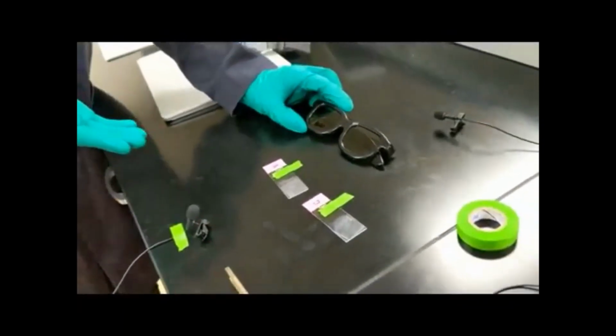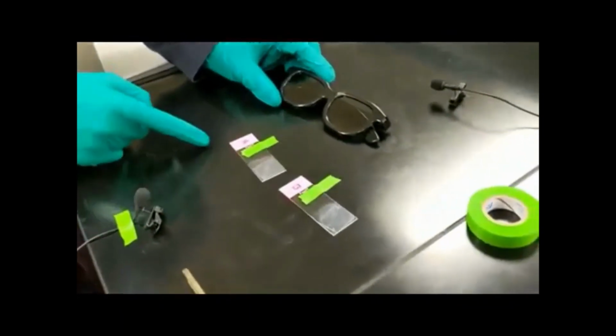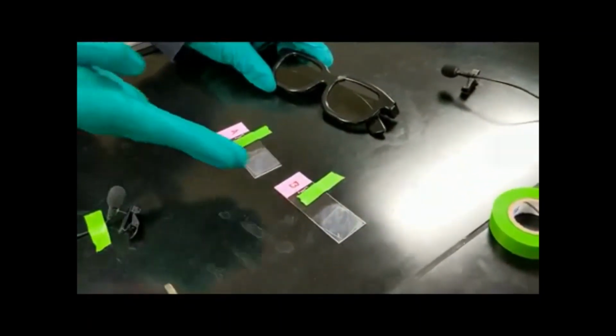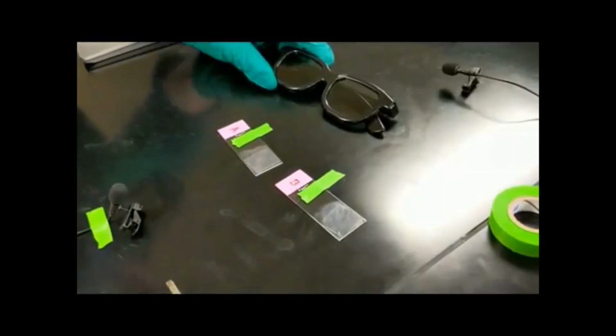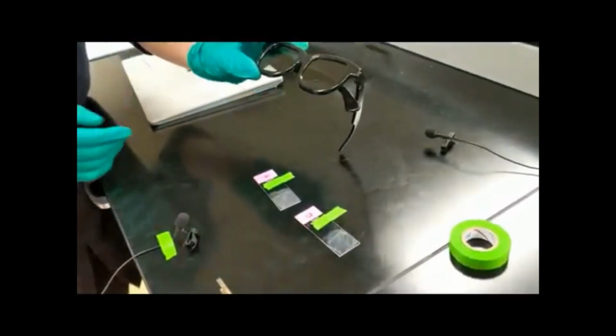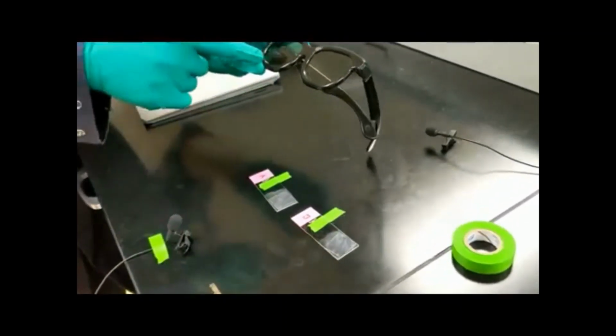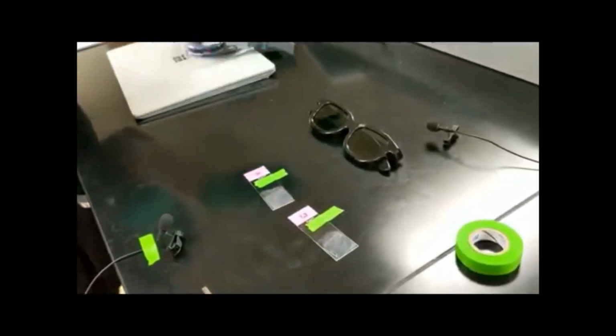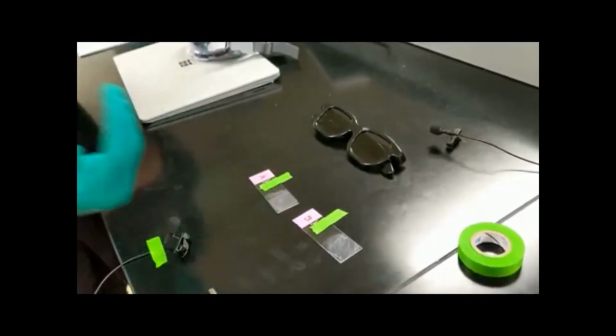Now that we've prepared our samples, what we need to do is analyze them by looking through polarized lenses in order to see how the polarized light is affected differently by each of these crystals. In order to do this, we'll be using a pair of 3D glasses, where each lens on a pair of 3D glasses has a different polarization. So if we look through the left versus the right eye on the glasses at each of these samples, we should notice a significant difference in the way that the liquid crystal looks.